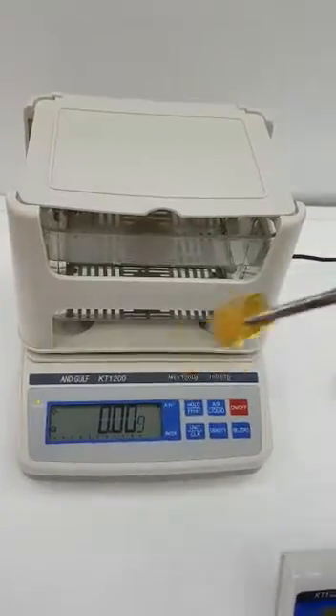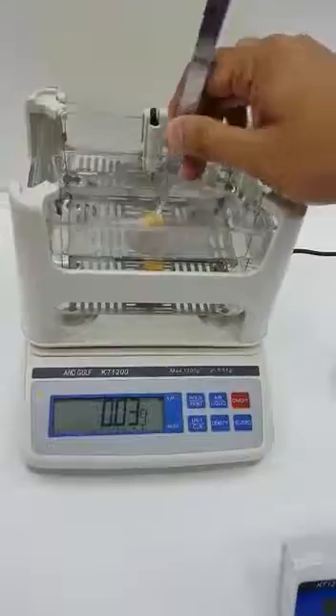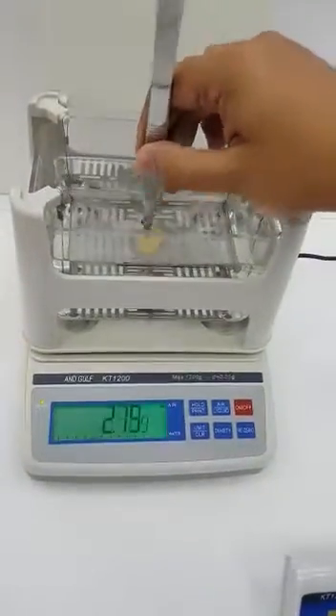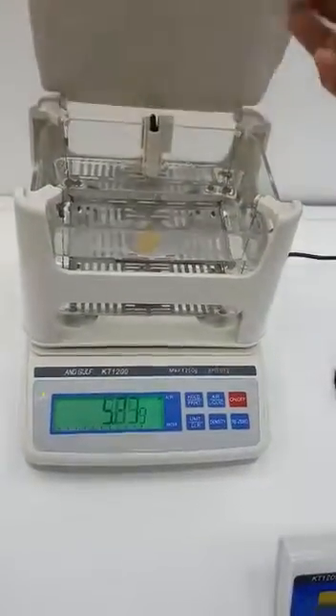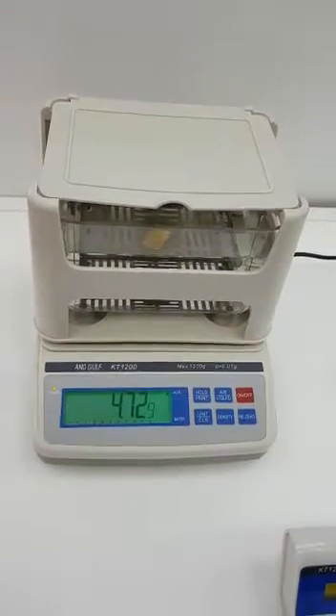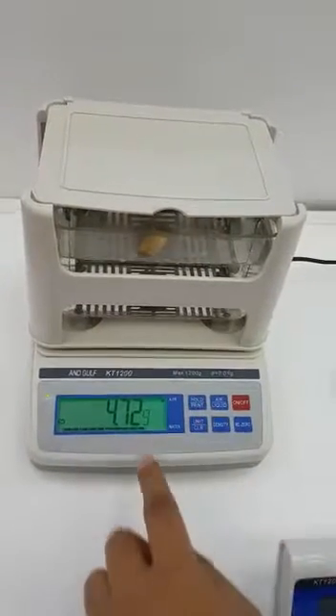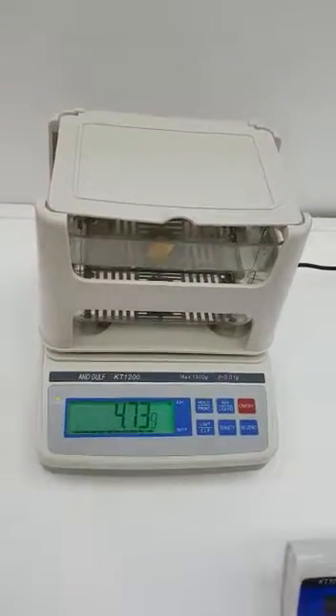Get your sample, open the lid, and put it in the water. Make sure there's no bubble behind it, as that will not give you the exact weight. Wait for the stable sign again, press hold, and wait for the bar to complete.